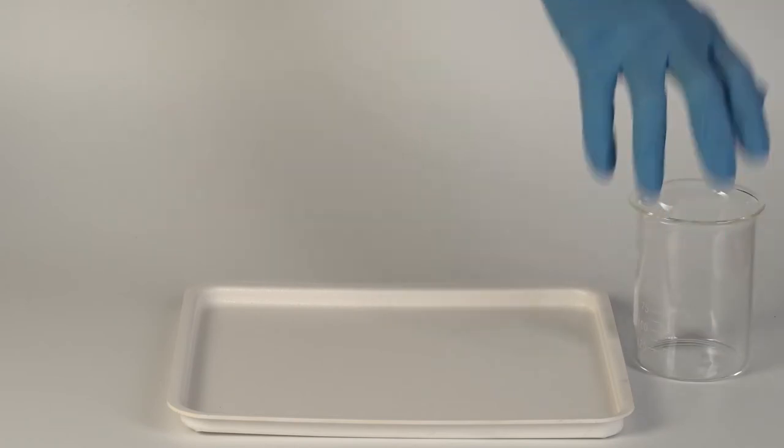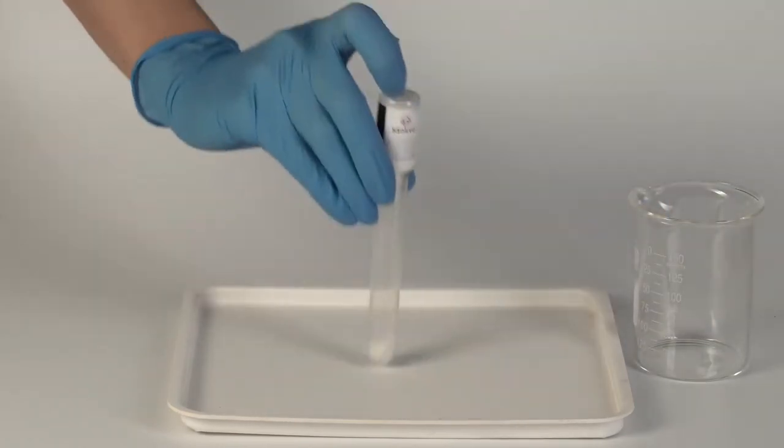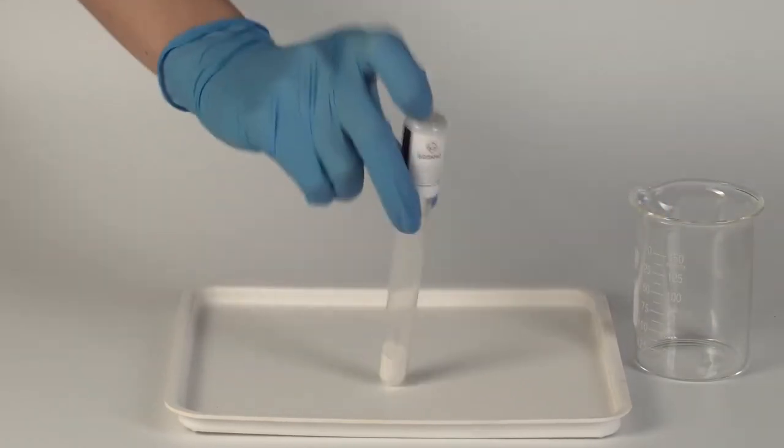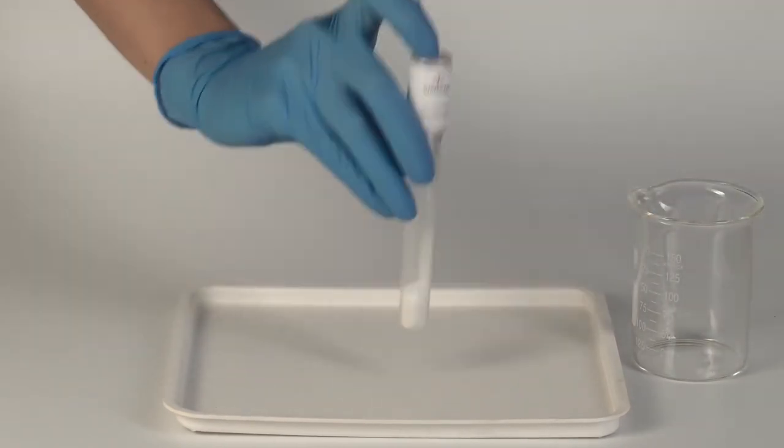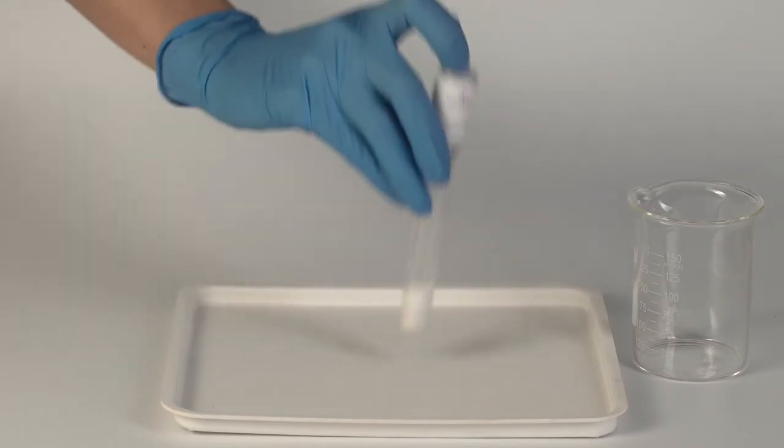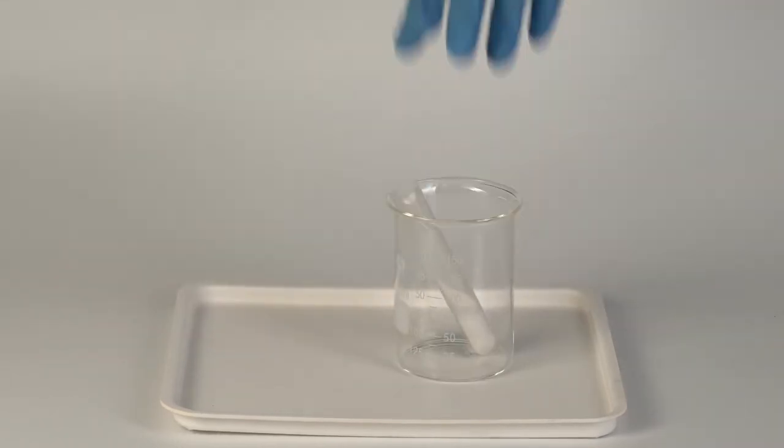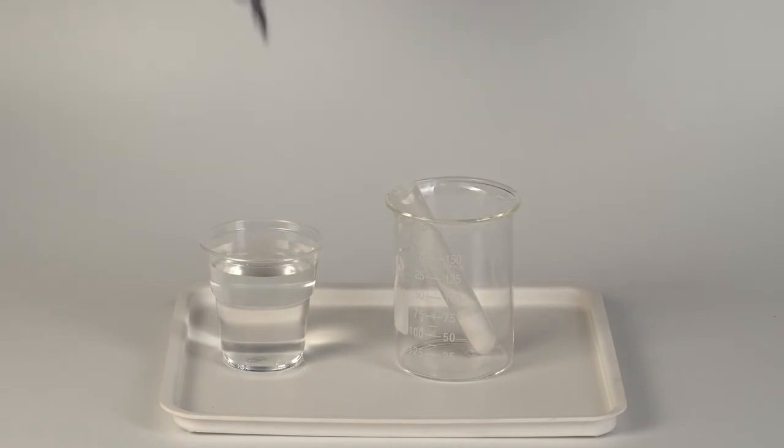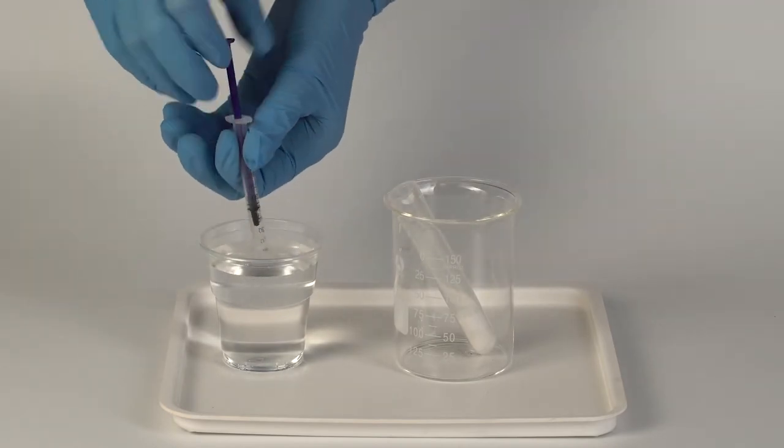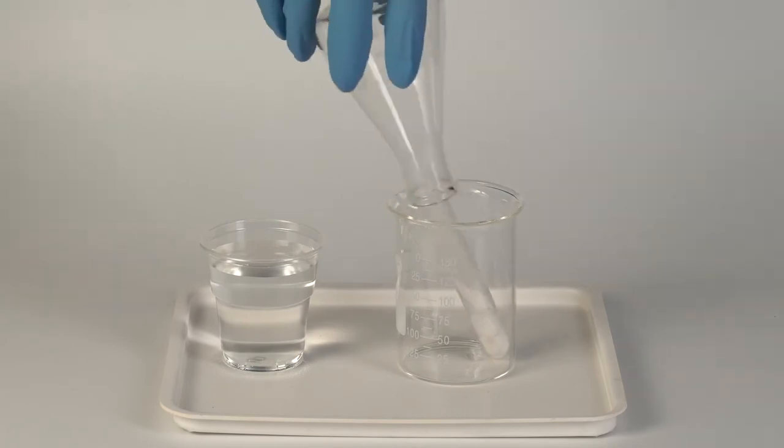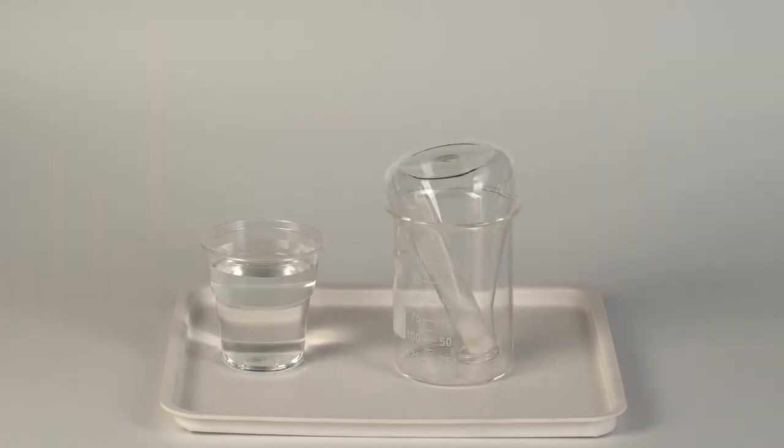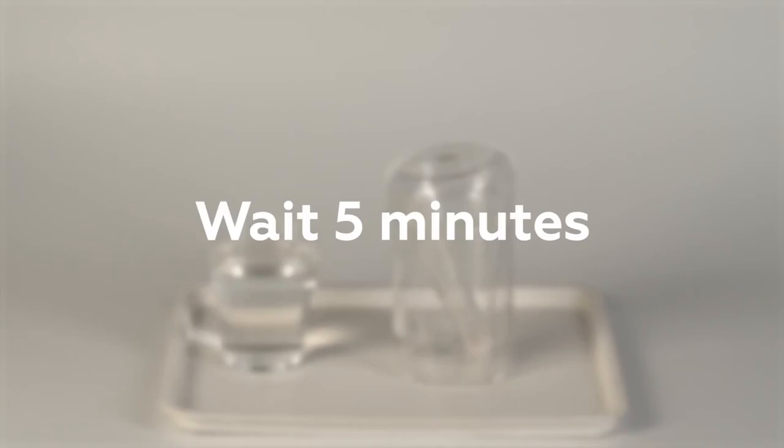Pour a whole bottle of calcium oxide into the plastic test tube. Then add all of the ammonium chloride. Now put the test tube into the beaker. Using a syringe, measure 0.5 milliliters of water and add it to the test tube. Cover the test tube with the flask and wait for approximately 5 minutes until the mixture stops bubbling.